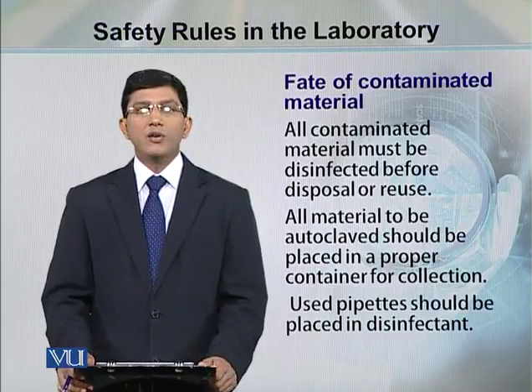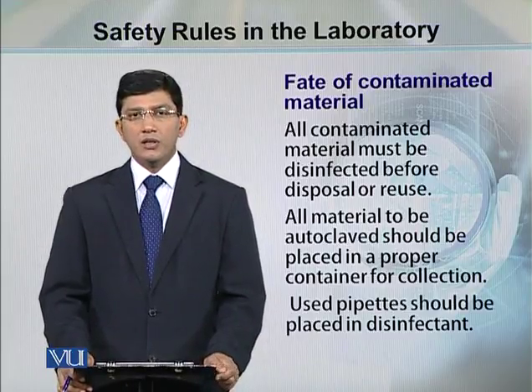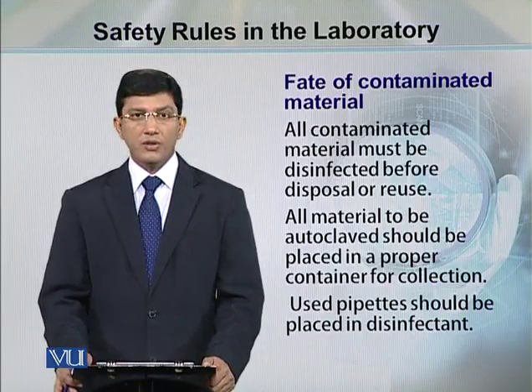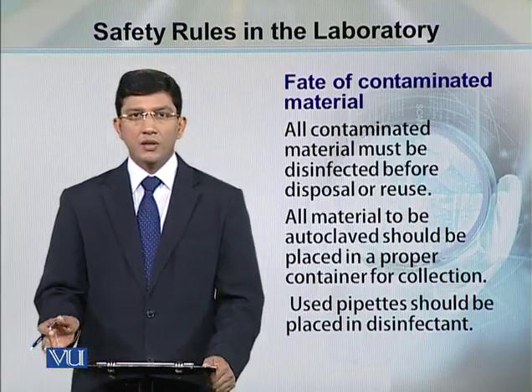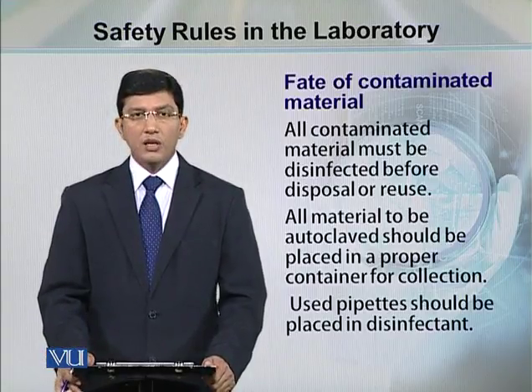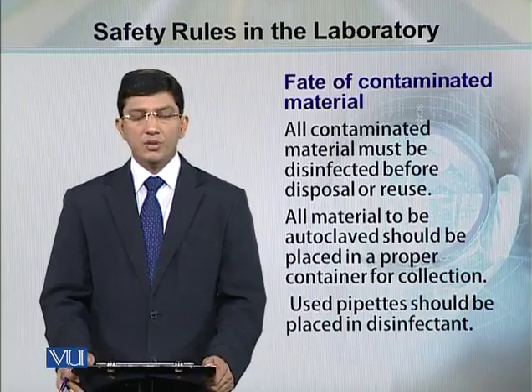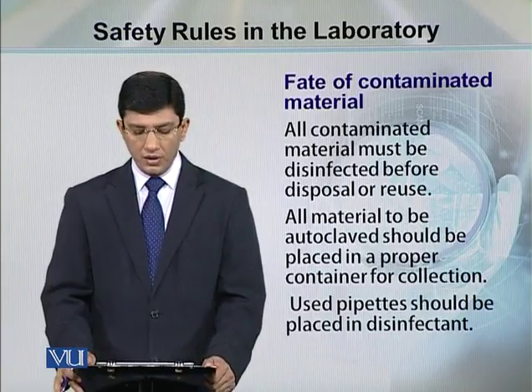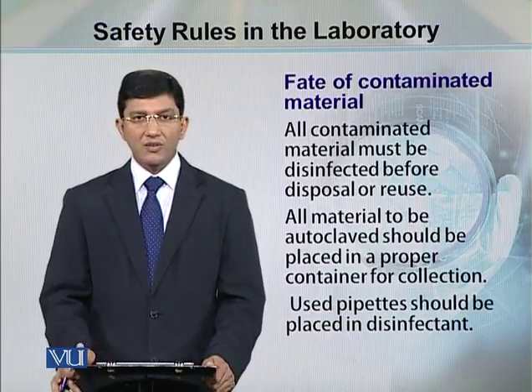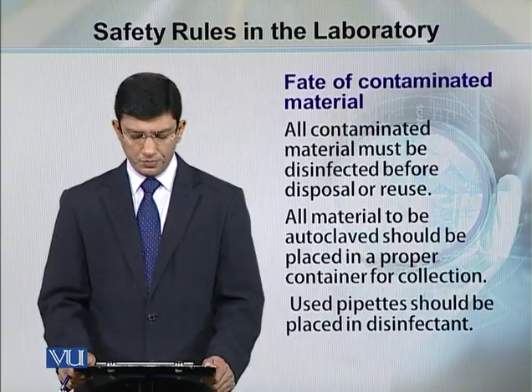When you have completed your work, the fate of contaminated material, contaminated glassware, and plasticware needs to be decided. The contaminated material should be properly disinfected before disposal or reuse.